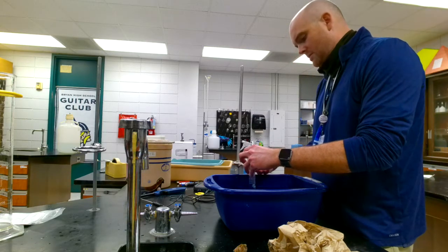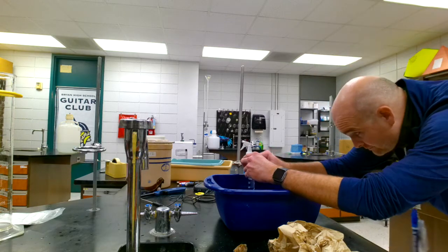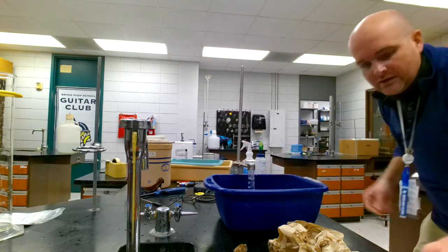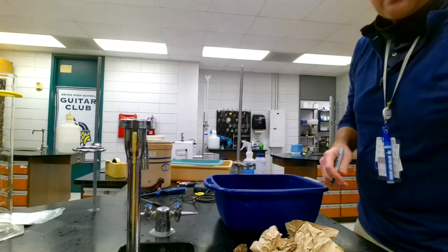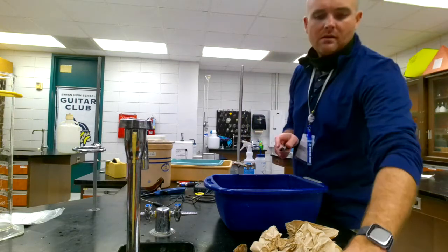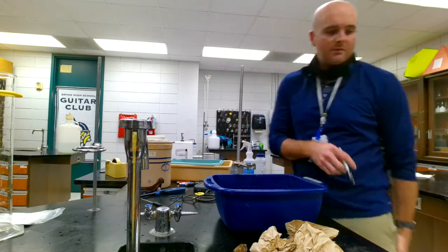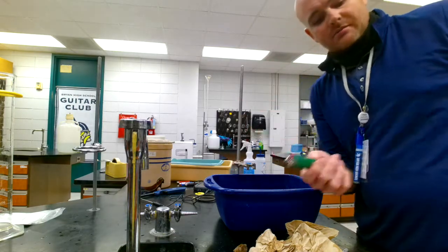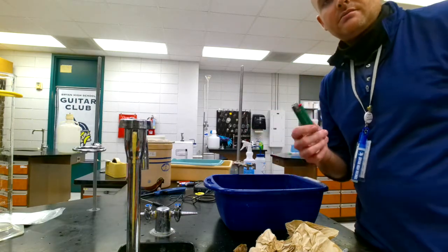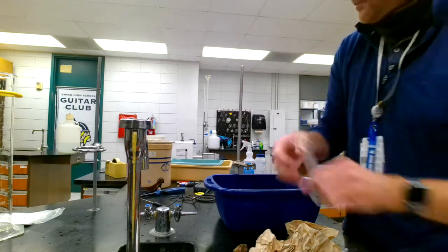So let's see where our volume stands. We're going to mark the level of where it is. It was about 16.6 milliliters. 16.6 milliliters is what we were looking at. So let's try that one more time. I'm not going to reweigh it again because I'll just take that last value right there. We know that it's bogus, so we'll just try again.